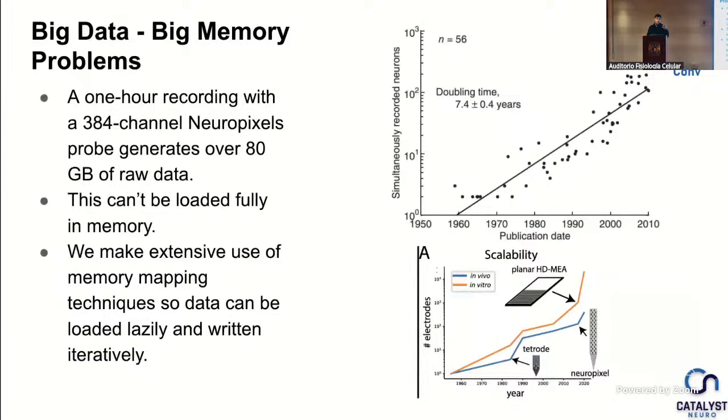As we mentioned, and you are very well aware, data is becoming larger. Neuropixels, for example, or any volumetric imaging that you might use with a two-photon microscope, is becoming larger and larger. Most people don't have the computers to load all of this into RAM, so you can write it to NWB. So we also provide tools that under the hood load the data bit by bit and write it bit by bit. So you can load these on most common systems, like most computers that postdocs or PhDs or lab technicians will have to do their analysis, and the conversion should work.